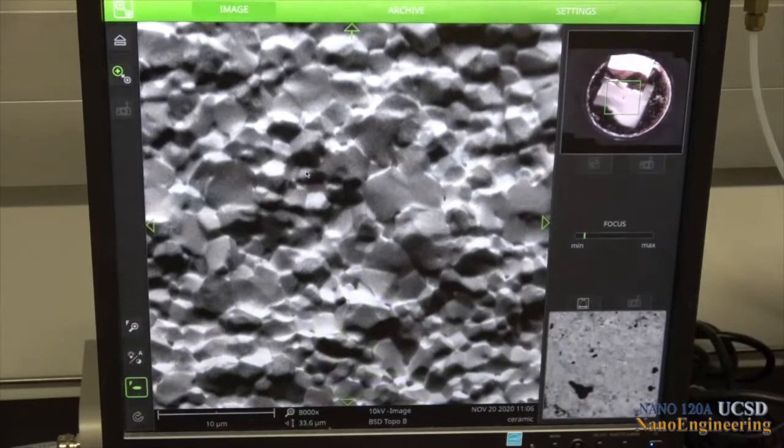In a similar manner, we can get yet a different topographic perspective by going back into settings and choosing topo B for our detector.